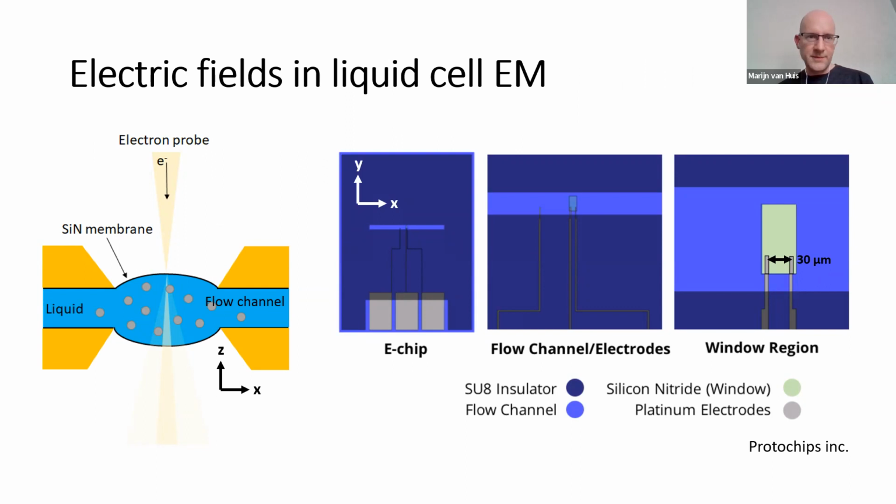The next step is electric fields. So can we really control this motion? So the motion so far that we have seen of the rattles is random. So there's no 3D preference. So it's confined in the shell at the center and less to the sides, but there's no directionality involved.